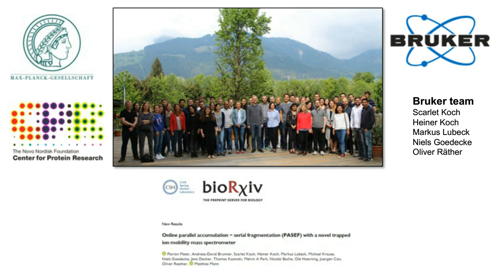When a HeLa cell digest sample is running, is the 50 centimeter C18 column a commercial column? And what company is it? So in this case, we use our in-house columns with the in-house pulled emitters packed with C18 beads from Dr. Meier. The inner diameter of the column is 75 microns.